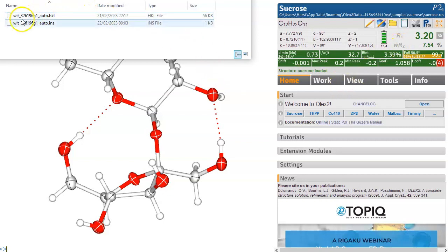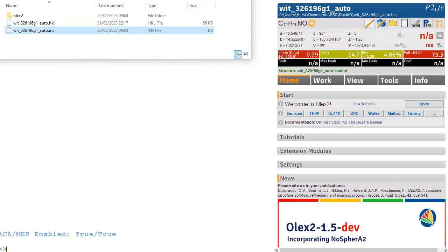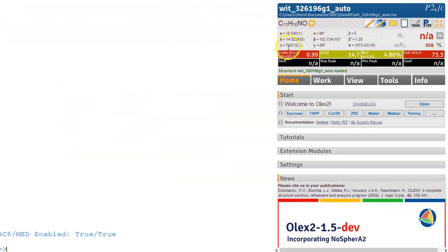Let's look at a little structure. We've got an ins and an hkl. Normally there would be some other files, the files that contain some metadata about the data collection. Let's not worry about this right now. So all I need to do is drag the ins file into Olex2. So what that does, it opens that ins file and it gives me straight away some information.